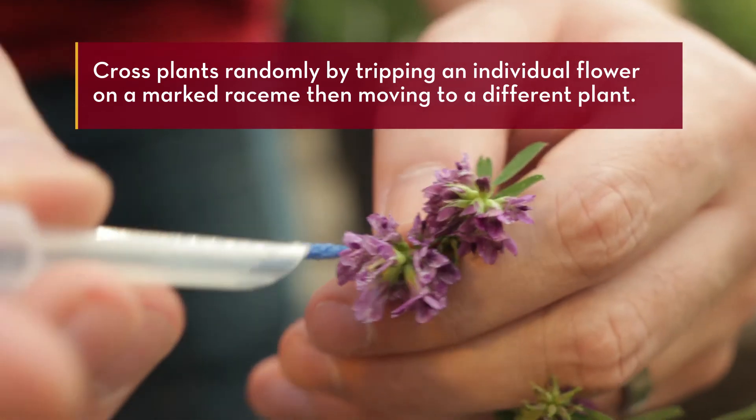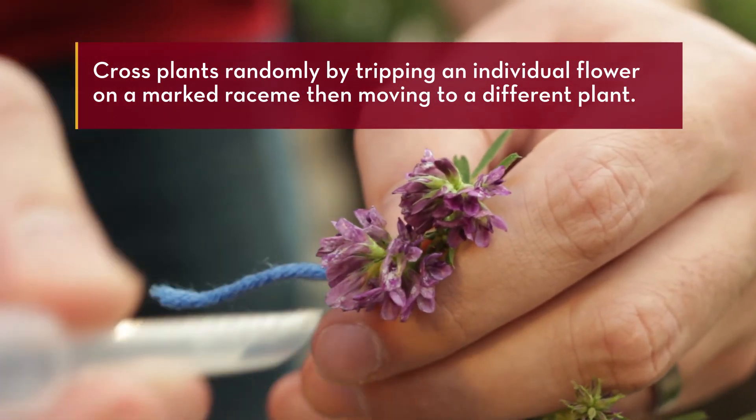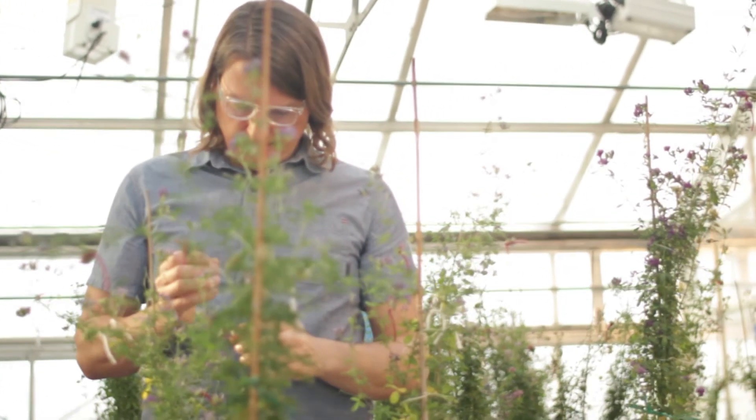Finally, cross plants randomly by tripping an individual flower on a marked raceme, then moving to a different plant. Continue until all flowers of the three marked racemes have been pollinated.